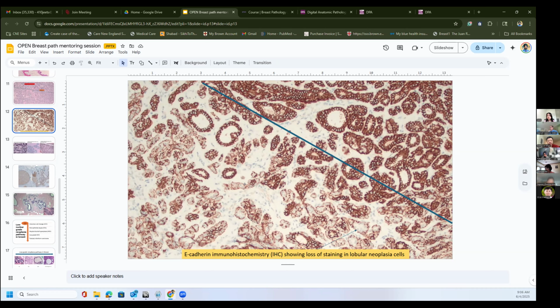And the reason you want to put it in formalin in 1 hour is to avoid the pitfall of losing estrogen receptor expression. Yeah, so fixation is important. And now you can tell whether a tissue is fixed or not by looking at it. When a tissue is not properly fixed, you lose the cellular details. The tissue will look a little fragmented. Tissue doesn't look intact. And you can tell, oh, this tissue is not fixed properly. It will look ischemic or a little bit necrotic.